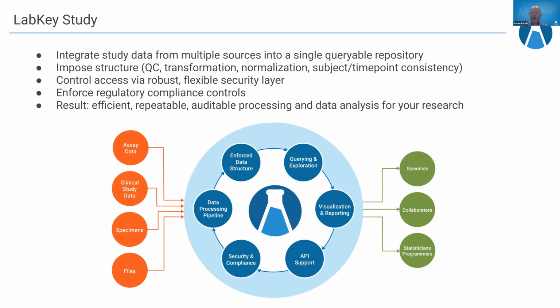Now, of course, on top of all of this, any data that goes into LabKey, any of our products, there is a robust and flexible security layer that controls access to that data. So as an administrator, you have full control over who sees the data, if anyone, who gets to change the data or update the data, if anyone, and you control that across the entire system, providing permissions and access control in each partition of the data.